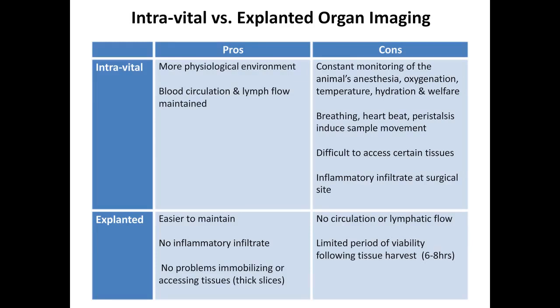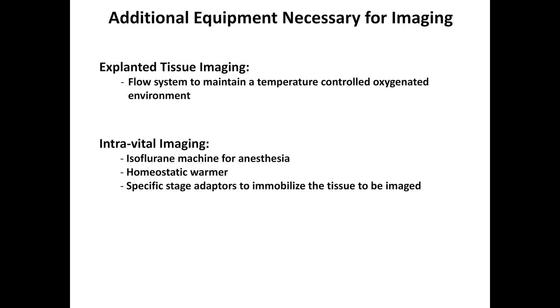On the downside, there is no blood circulation or lymphatic flow, so depending on the type of scientific question that you are interested in investigating, this might not be an option for you. Also, the organ, once it's explanted, has a limited time of viability. However, typically in a lot of tissues, you can keep the tissue healthy and live and image the cells in that tissue for up to 6 to 8 hours. So that's still a relatively good amount of time to study.